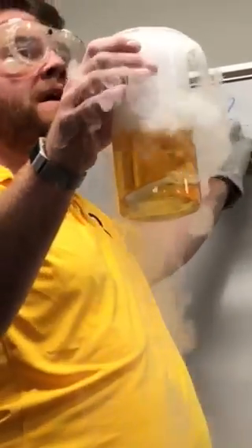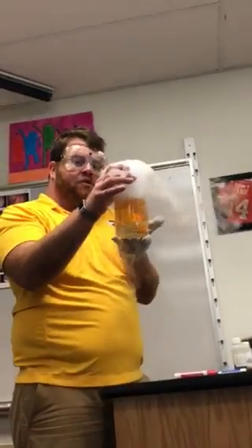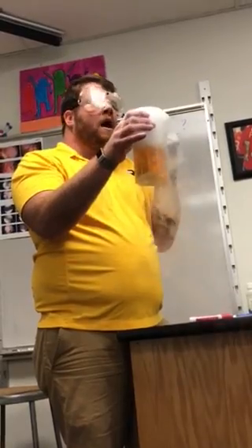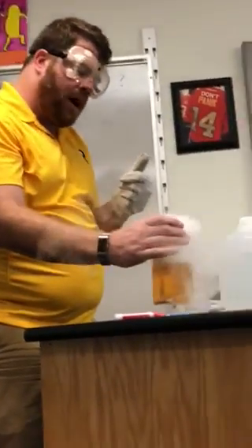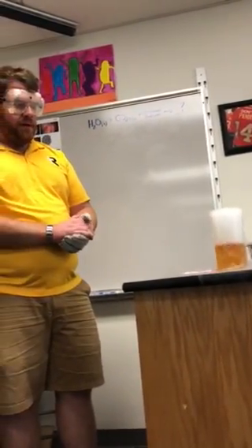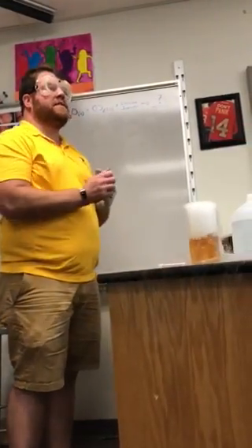And what's going on here is as this new product is being created, it's making more and more of this substance, and it's causing there to be a chemical change. You can't see anything forming because to our eyes it's so small, but the indicator can detect that something's going on. And it may take a while for us to actually get to that really dark red color, but this is a great example of a chemical change, and we're using this indicator to detect this, okay?